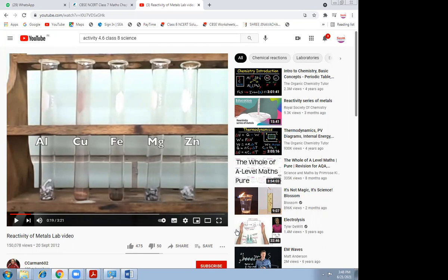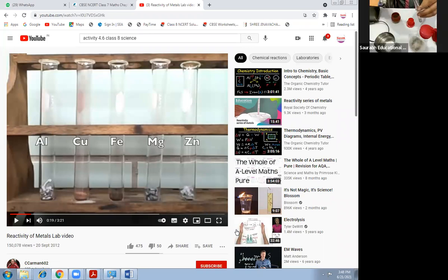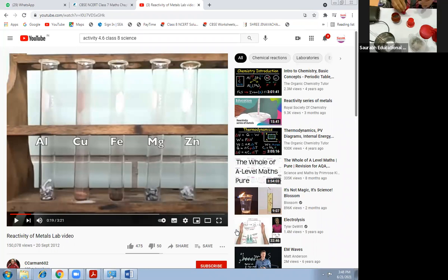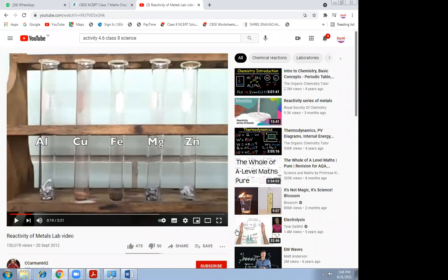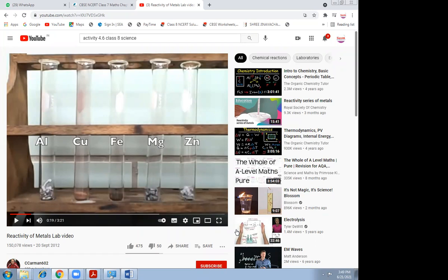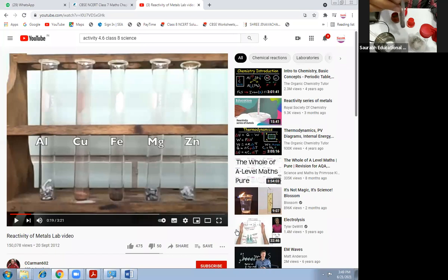Sir, I am adding hydrochloric acid, sulfuric acid in a test tube. And now, sir, iron? Yes. I think sulfuric acid doesn't work. Yes, you have to take some other acid.